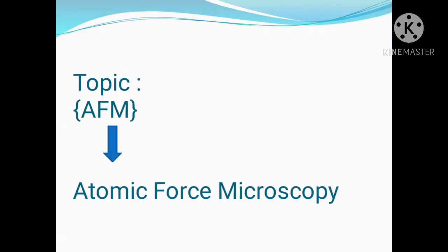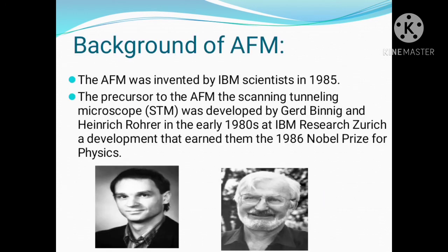The topic of our presentation is AFM, which stands for Atomic Force Microscopy. First of all, the background of AFM. The AFM was invented by IBM scientists in 1985.